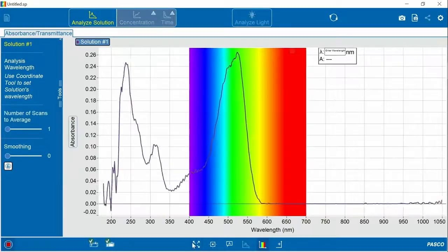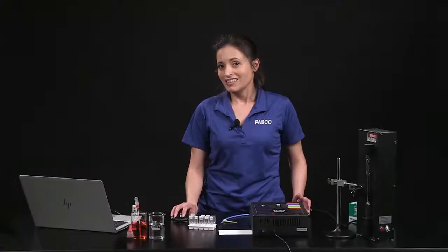I'm going to scale my data and increase the number of scans to average to improve the display. And as you can see, green wavelengths are highly absorbed by the solution, but red is not.